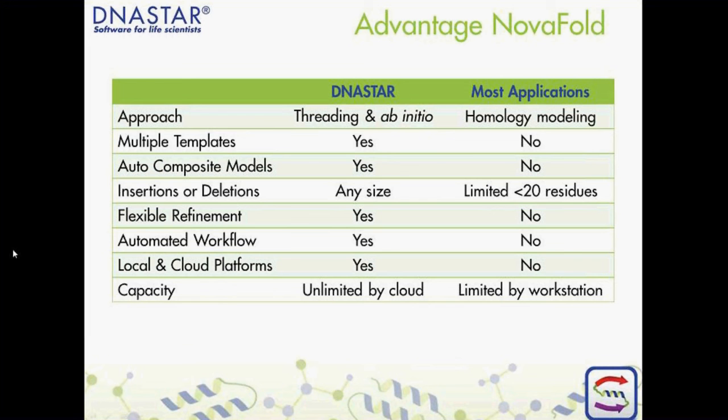And finally, with our newest release of NovaFold, we're proud to offer NovaFold both on the DNASTAR cloud, which offers security and unlimited computing capacity through the Amazon cloud, and also locally on a Linux workstation for those who prefer to do this work on in-house hardware.